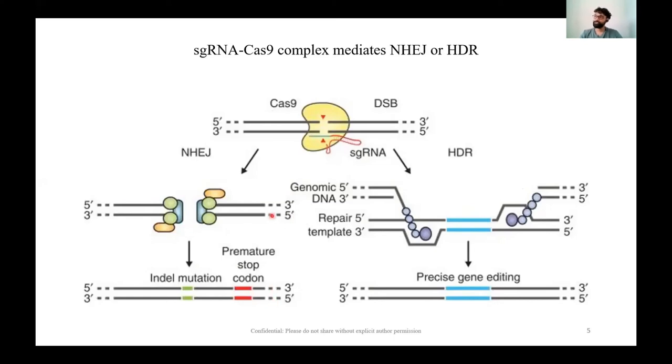So like I mentioned earlier, the outcome of a cleavage or a damage in your DNA is either non-homologous end joining, which leads to indels, right? Or in rare cases, HDR, homology-directed repair. Now optimizing the HDR is what will be the focus of today's talk.